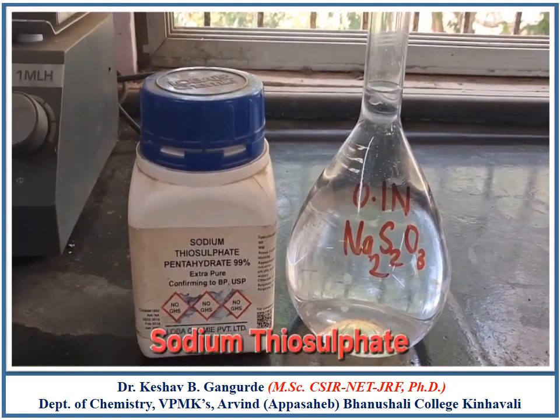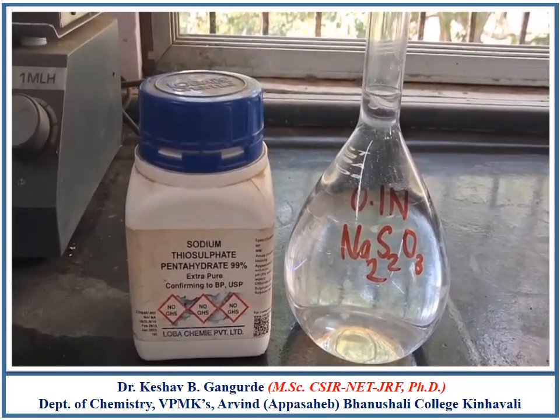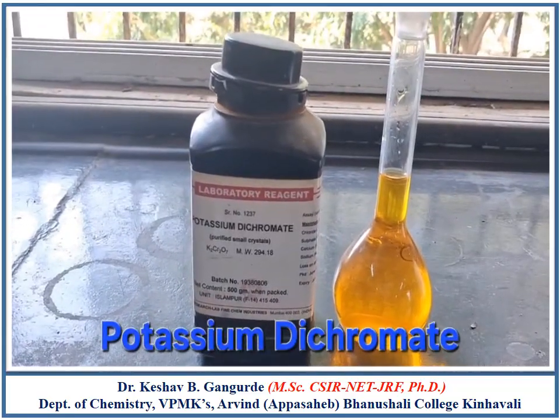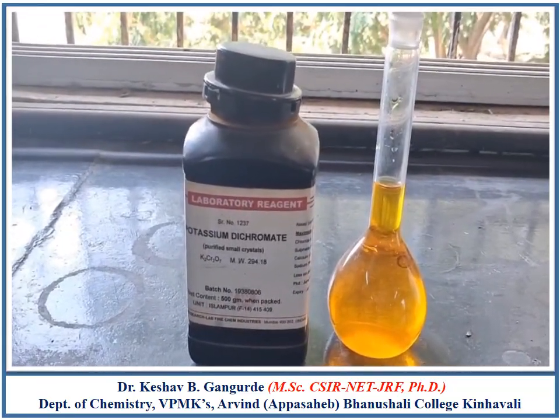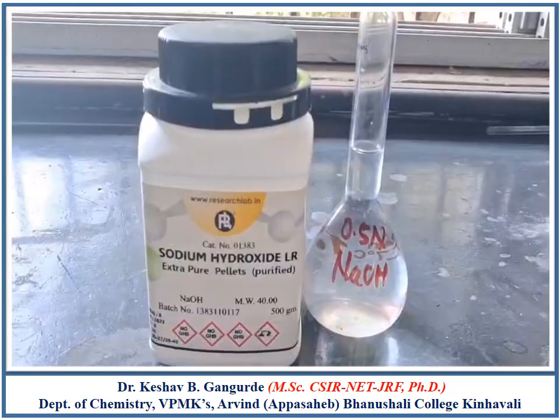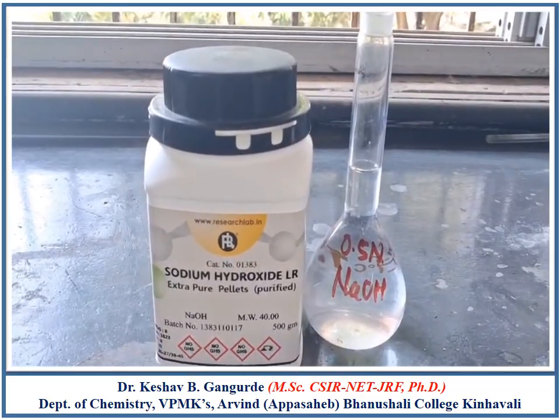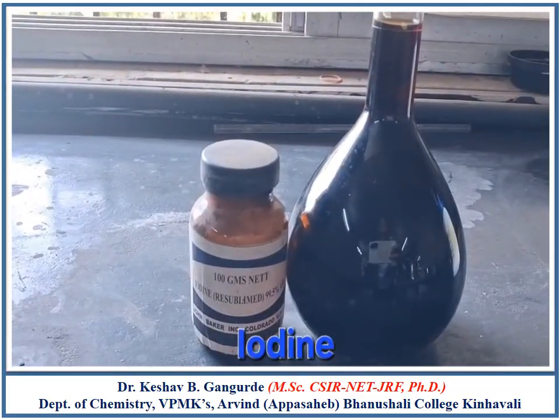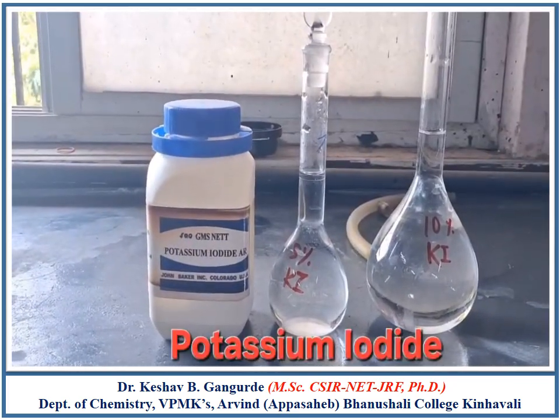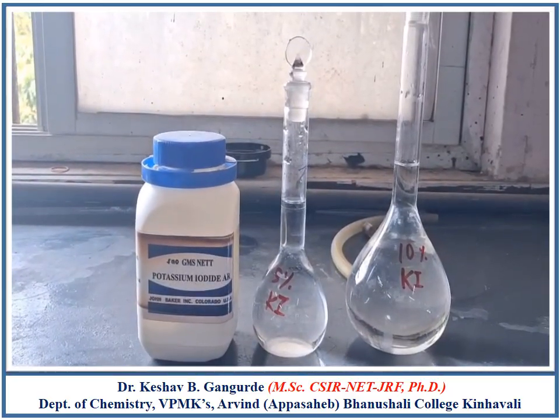For this experiment, we require sodium thiosulphate to prepare 0.1 normal sodium thiosulphate solution, potassium dichromate to prepare 0.1 normal potassium dichromate solution for the standardization of sodium thiosulphate solution, sodium hydroxide to prepare 0.5 normal NaOH, solid iodine to prepare 0.1 normal iodine solution, potassium iodide to prepare 5% and 10% KI solution.